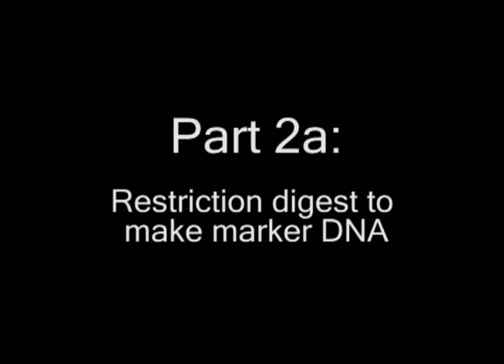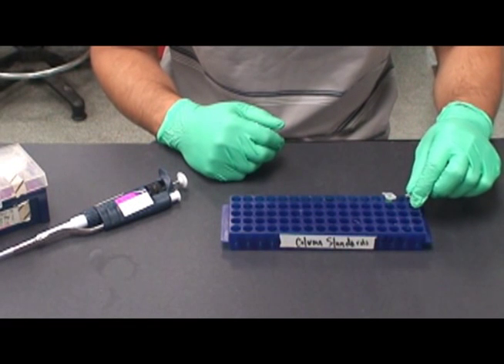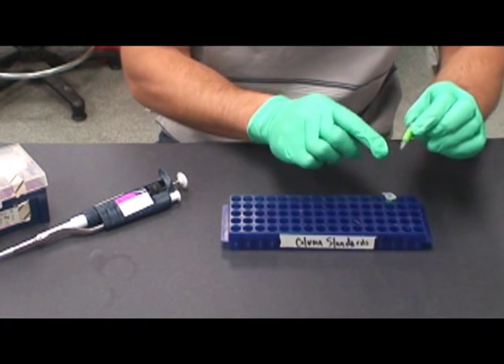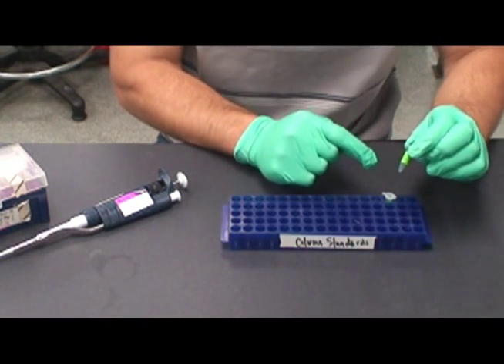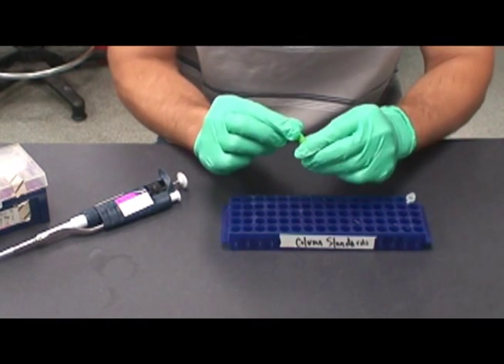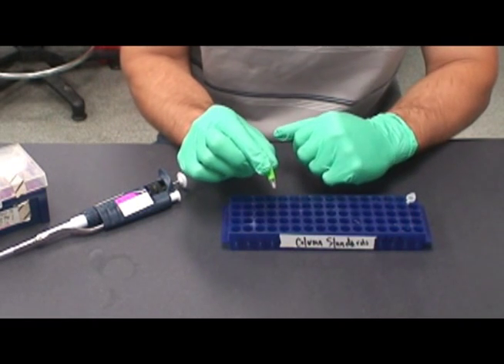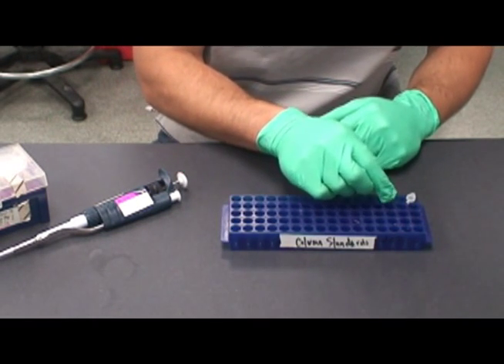The first step in performing restriction digest to make marker DNA is to label two 0.5 milliliter microfuge tubes. This tube is labeled Lambda DNA Hindi 3, while this tube is labeled Lambda DNA undigested. Make sure to include your initials on both tubes.